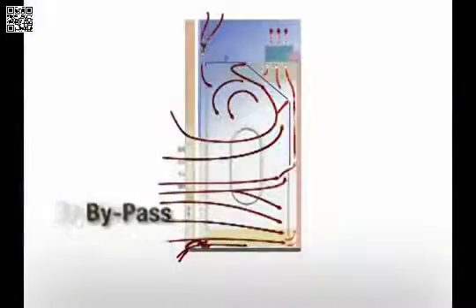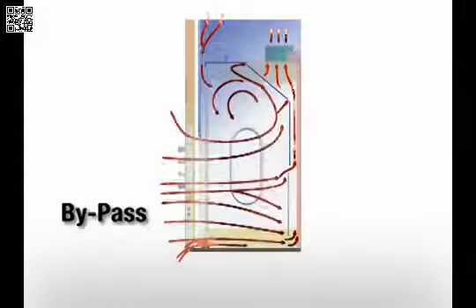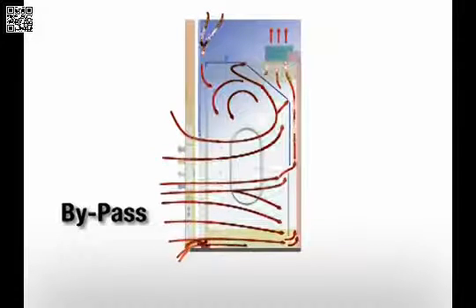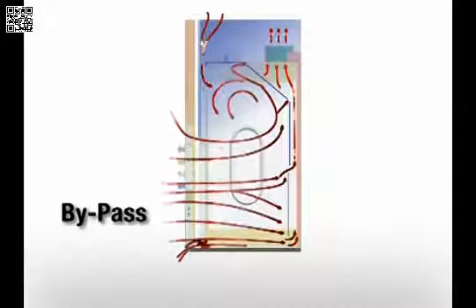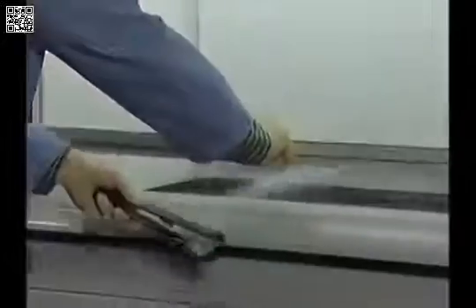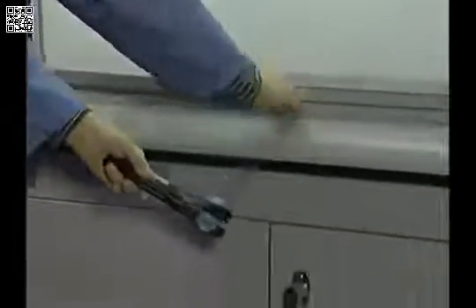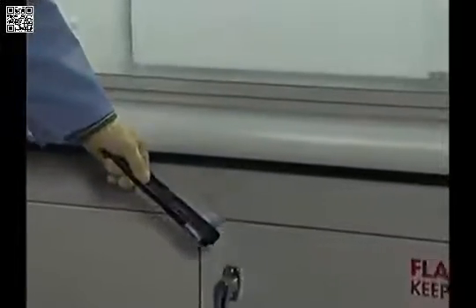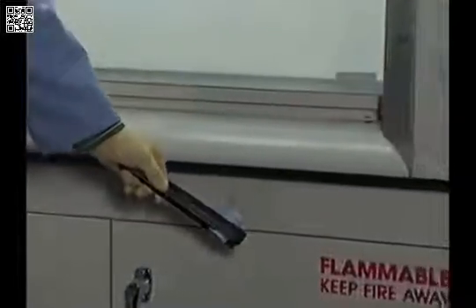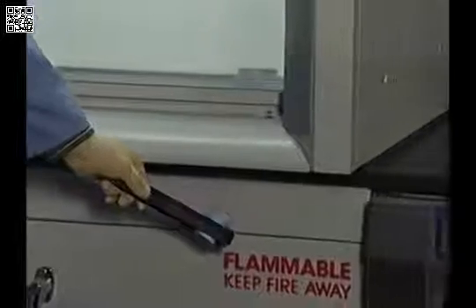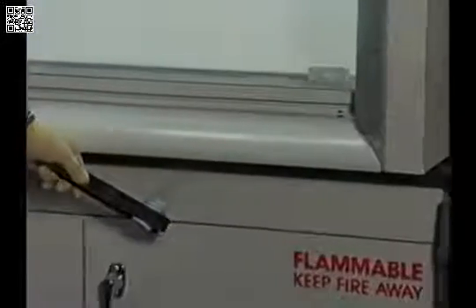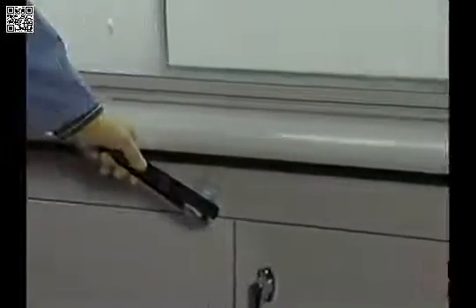The bypass hood is designed to minimize the fluctuations in face velocity as the sash is lowered or raised. Air enters the hood through openings along the top of the hood and underneath the airfoil, even when the sash is in the fully closed position.